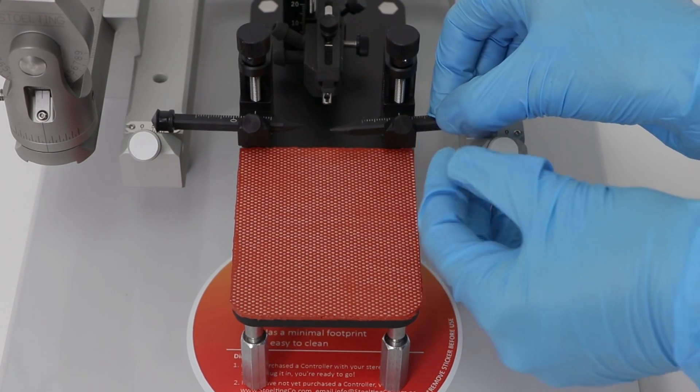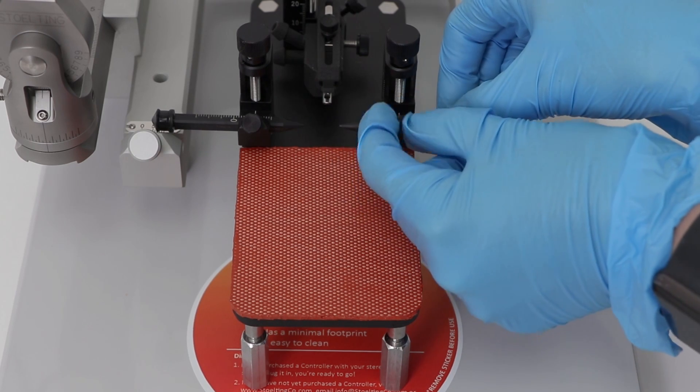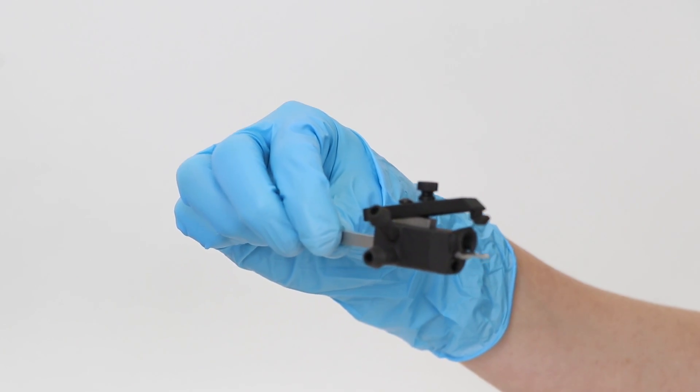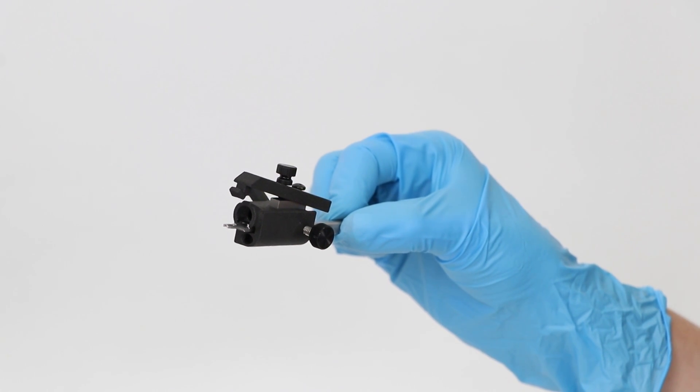Next, take the mouse ear bars and secure them in the corresponding brackets. Then secure the mouse anesthesia mask with the integrated adapter to the base accordingly.